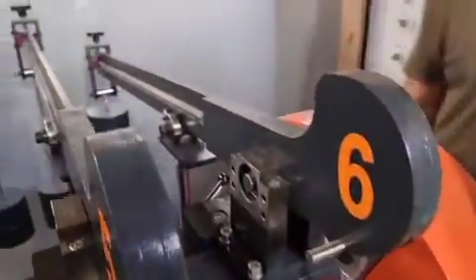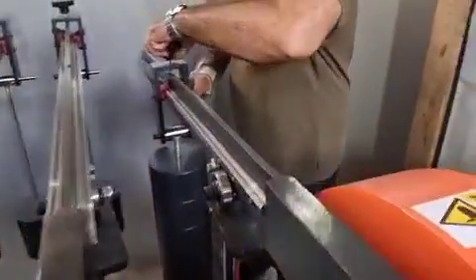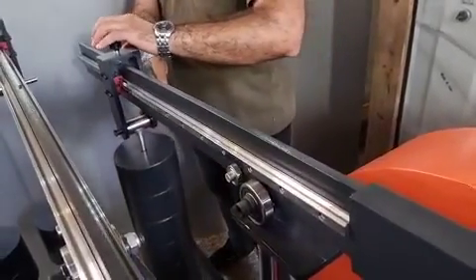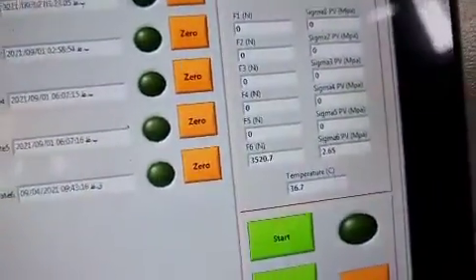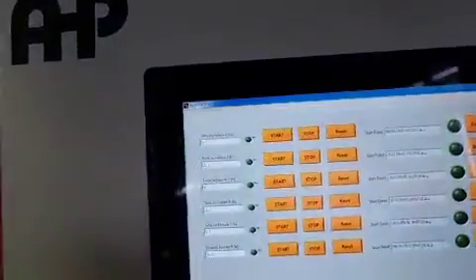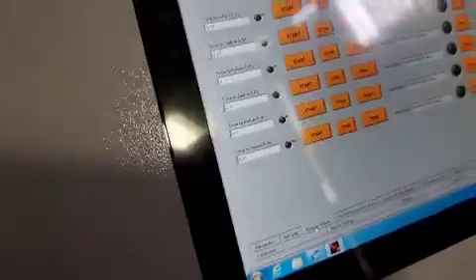Then you go to the time-to-failure page. The sample is already loaded, and the force is adjusted. The force is adjusted using the sliding mechanism here — you adjust the slider to the position where you achieve the specified stress in the cross section of the samples, and after that you fix it in position. As you know, a tensile creep test uses a stationary, constant load.